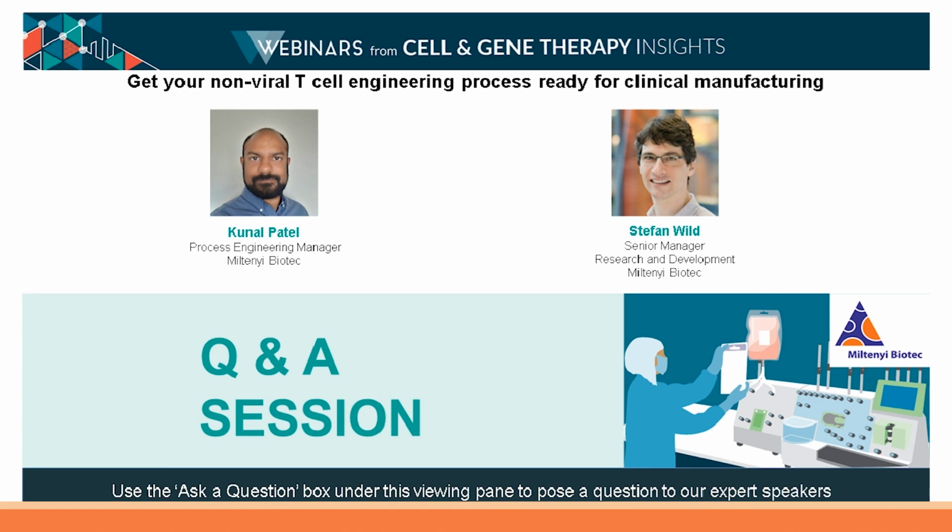and won't require as harsh of a pulse to get a high transfection efficiency. But in the end, especially with the way that the Miltenyi platform is, it's very customizable, where you can really fine-tune pulse parameters for your specific gene editing strategy, and really play with maximizing transfection efficiency versus cell death, and you've got to find that balance with the expansion potential of your cells as well. But in general, with knock-ins, you can get a pretty decent efficiency. Maybe not quite as high as viral methods currently, but still somewhat comparable, I would say, and it's only improving as we get more and more experience.